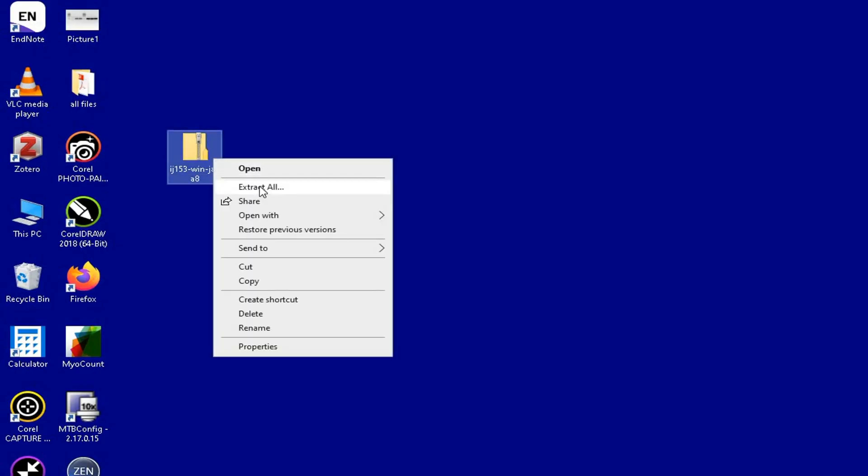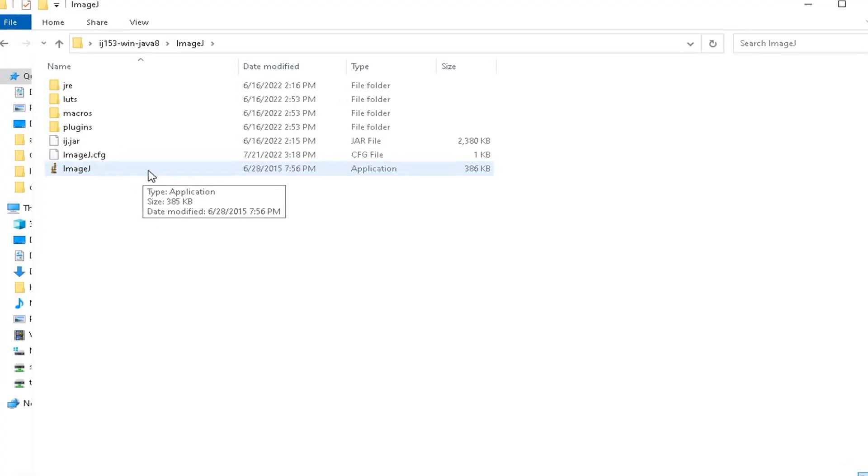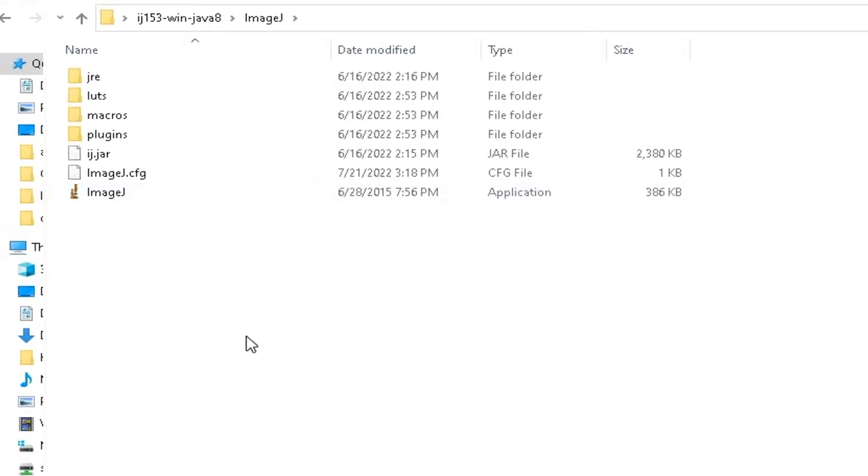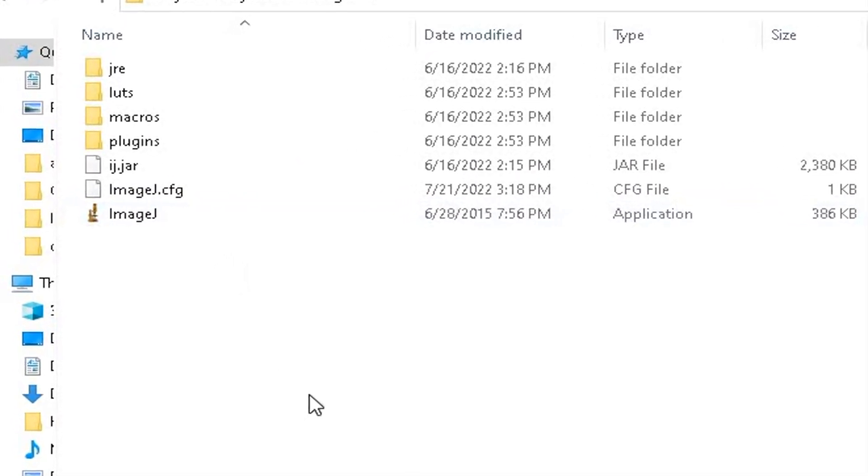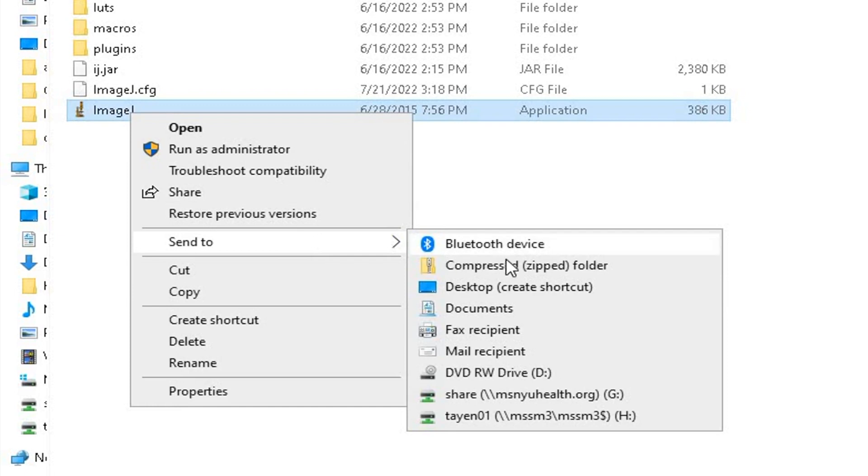After the download has been completed, extract the file and find the ImageJ icon inside the folder. For your convenience, the ImageJ icon can be exported to the desktop.